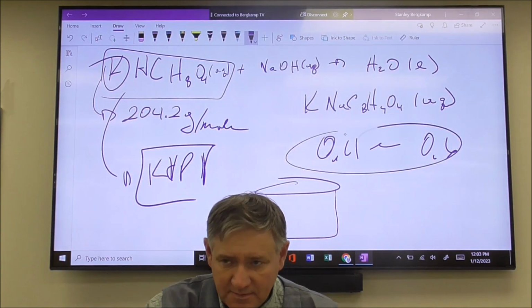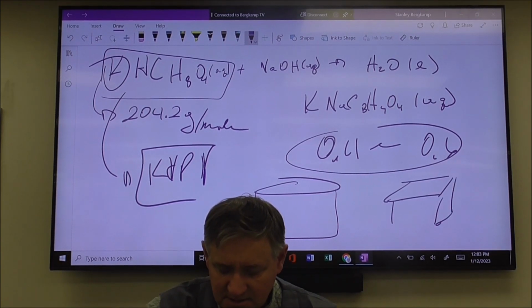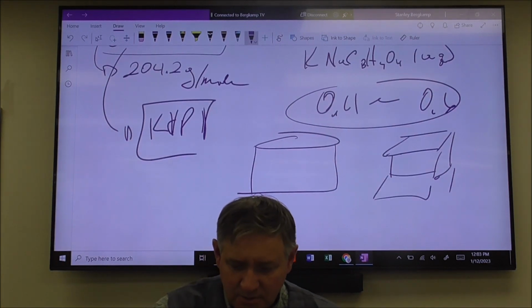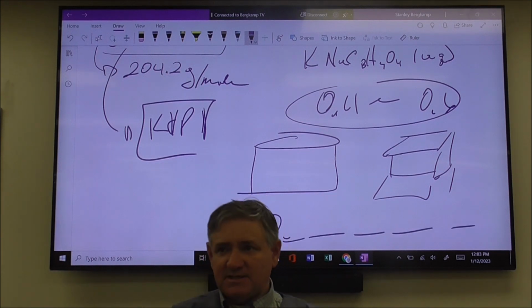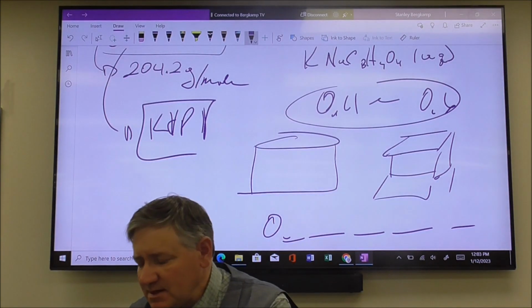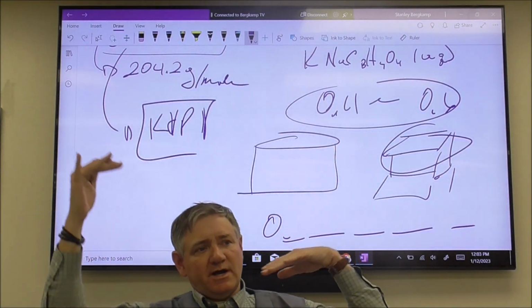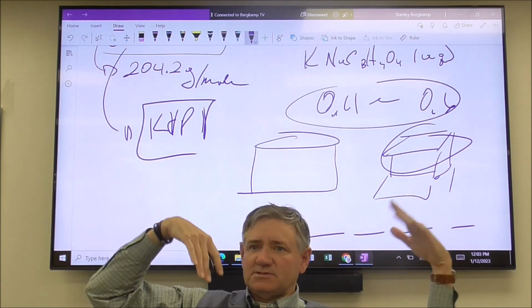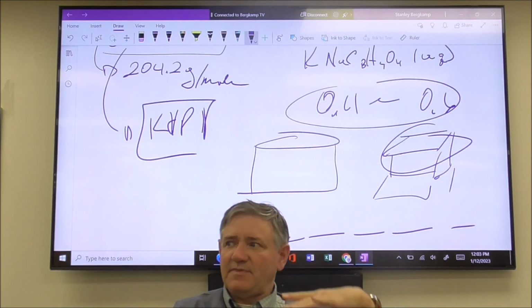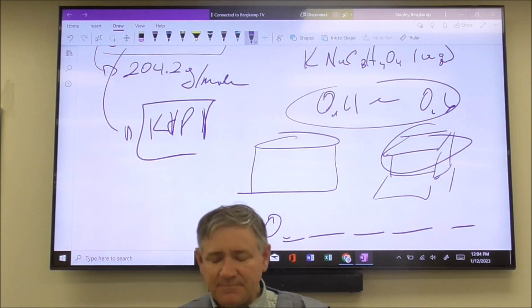On the scales that you're going to use, we use very, very highly precise scales, and some of you might use these in Chem too. These scales measure out to 4 decimal places: tenths, hundredths, thousandths, ten-thousandths. They're so precise that we have a glass case around them, because otherwise, if the air conditioner is on and there's air moving out of the vents, it's so sensitive that air movement will alter the reading on the scale. That's why they're in a glass case.